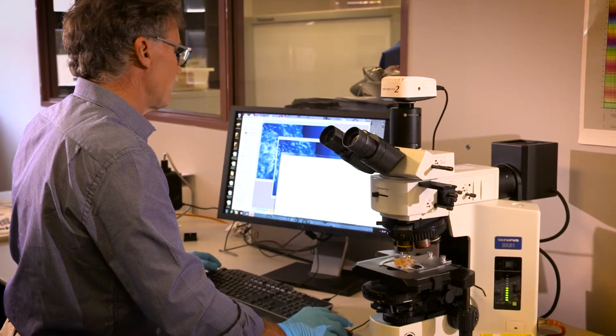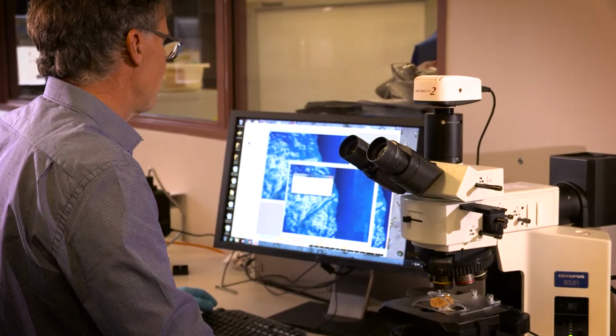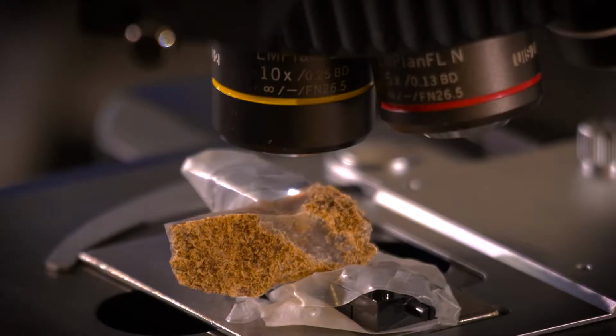Together with Matt, Thomas, Mike and Richard, we wrote a sampling protocol which was applied in the field. So we do have input on how the samples are collected. We just don't do it ourselves, obviously, because the archaeologists do that. And then from the site, the samples get sent to the lab where Richard has a look at them, using wet analysis and also microscopy, and he identifies or screens the stone tools for any interesting residues that we may find.